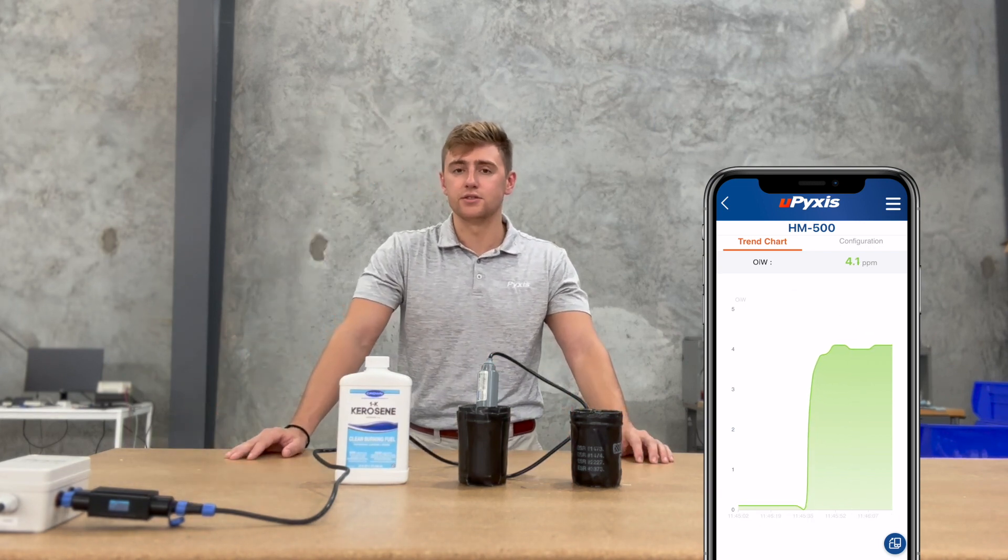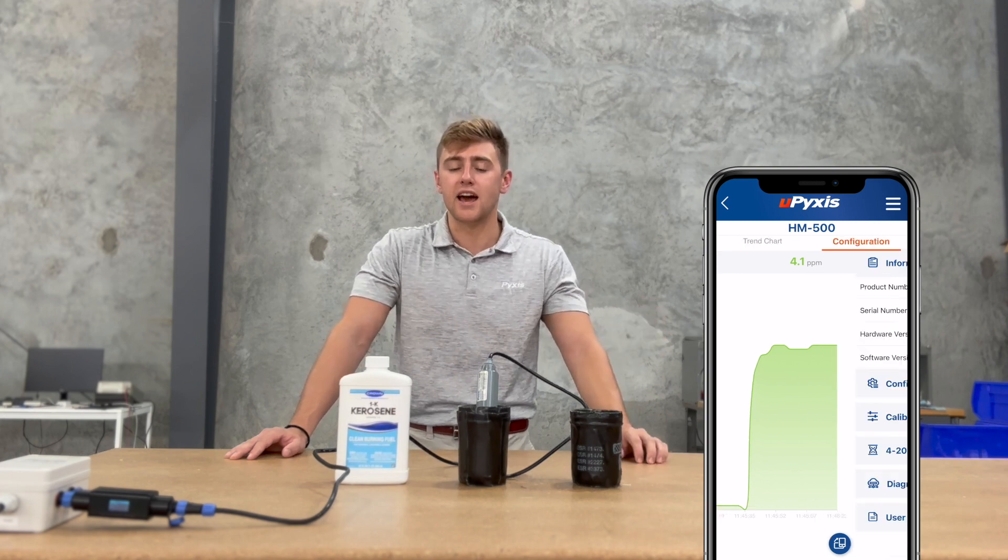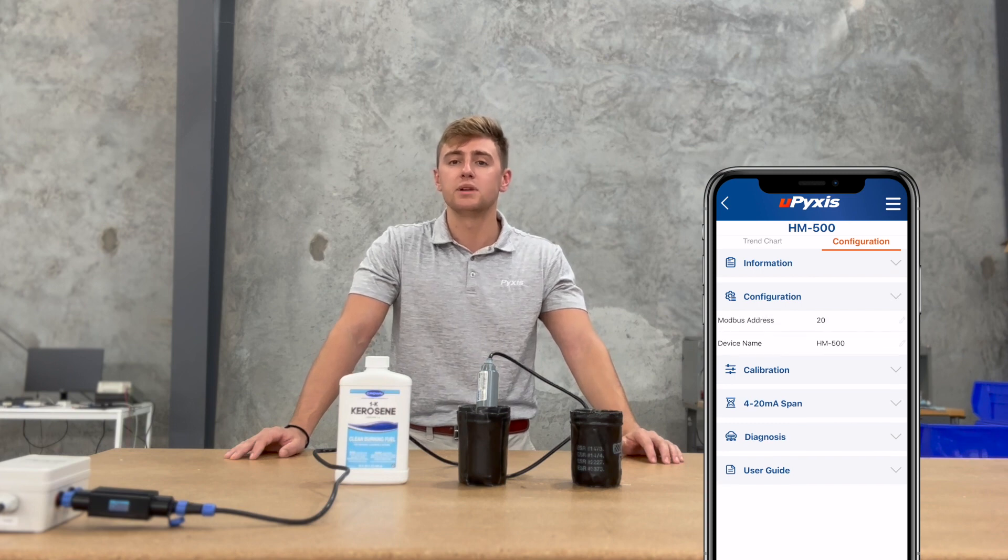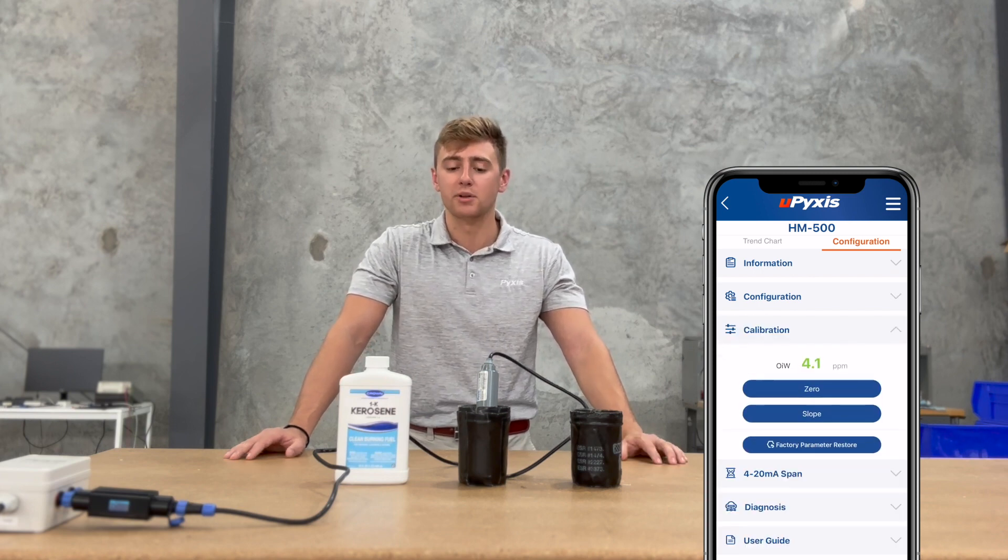And then again on Pixis there's even more things under the configuration tab. You can configure the sensor, you can calibrate the sensor. It has all those nifty settings for you guys to manipulate so it fits your application specifically.